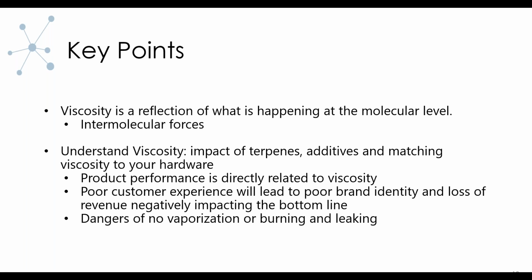Product performance is directly related to viscosity, and if you're not doing the viscosity work up front, that could lead to poor customer experience, leading to poor brand identity, loss of revenue, and that would negatively impact the bottom line. Some examples of negative customer experiences are no vaporization, burning, or actually leaks.